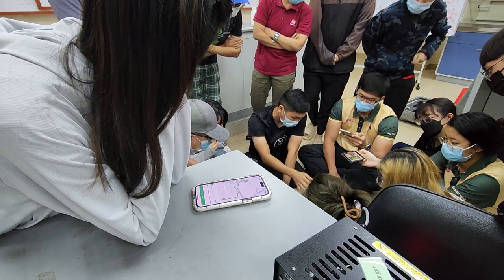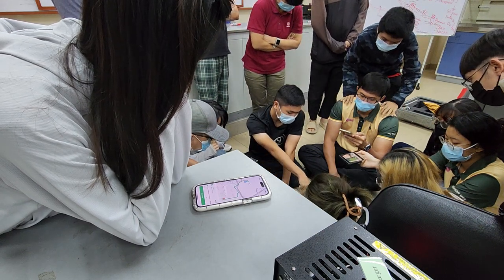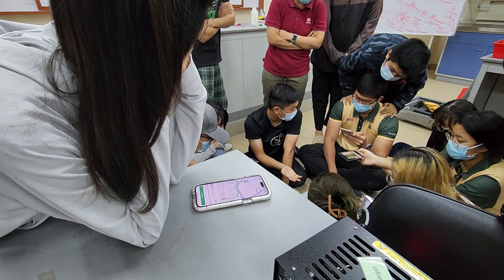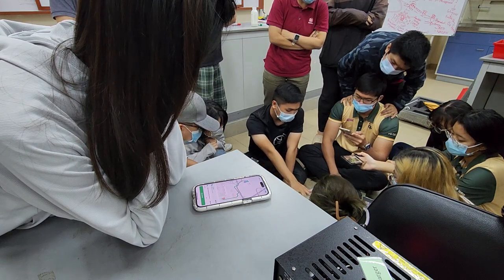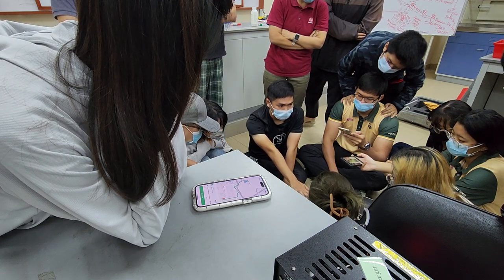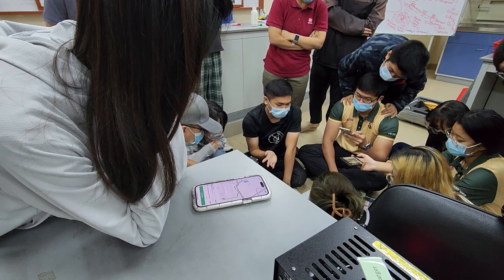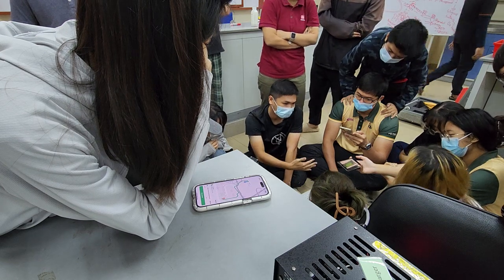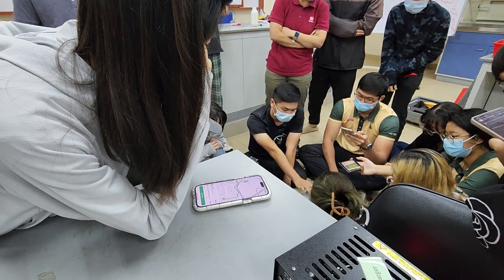How do we identify that it is already stable? You can see on the graph here. It is not stable yet. When the graph stays constant, it is the time for you to take the readings. Both graphs. For the stomatal conductance, make sure it is not negative. But it is still negative. It might be the response to the treatment on the plants, so it can be due to your research treatment. But as a standard rule of thumb, we just make sure it is not negative. This is not stable yet, so you need to wait for it to stay stable.